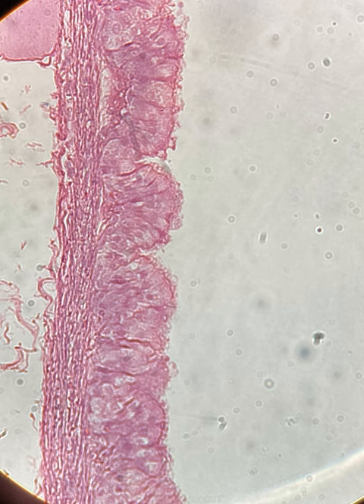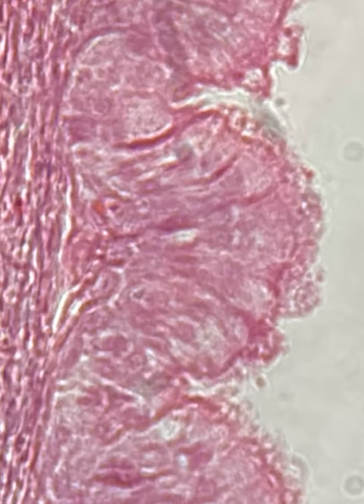And so you'll see here that you can see the little nuclei, and it looks like there's more than one layer. But there actually isn't, they're just really squished in together. And because they're so tightly squished in, it looks like there's more than one layer, but it's not. It's really just one really long squished cell. Well, not just one, but a bunch of them right next to each other.